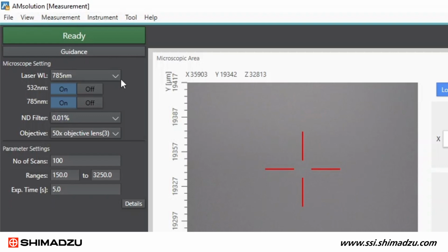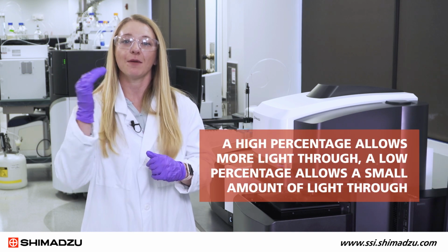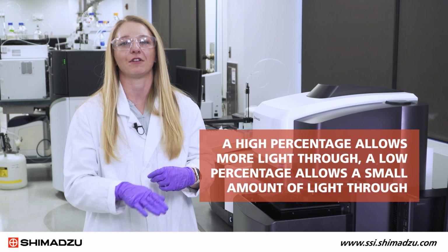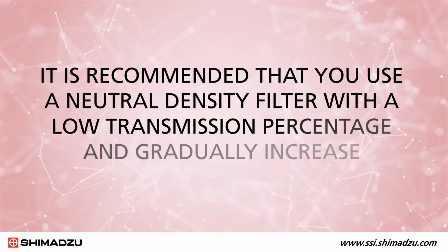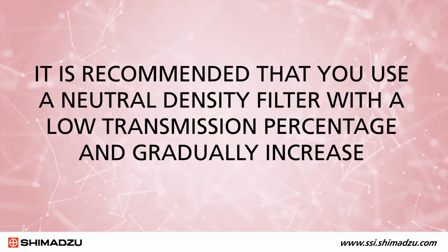Neutral density filters knock down the laser power reaching the sample, and the AIRsight offers 8 different dimming rates, ranging from 0.01 to 100%. These percentages are transmission percentages, meaning a high percentage allows more light through, but a low percentage allows a small amount of light through. Raman signal intensity increases with laser intensity, but that higher intensity also risks damaging your sample. So it's recommended that you use a neutral density filter with a low percentage and gradually increase.